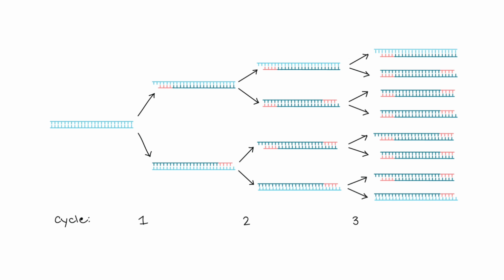In the succeeding cycles, the number of correct amplification products accumulates in an exponential fashion, that is, they double during each cycle until one of the components of the reaction becomes depleted or until the end of a defined cycle.